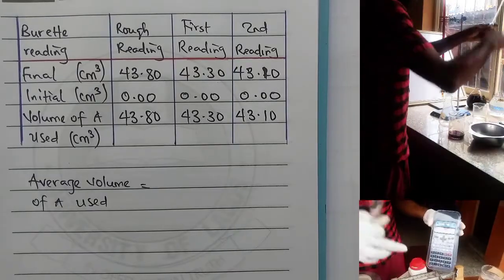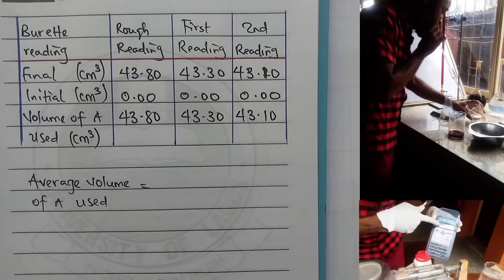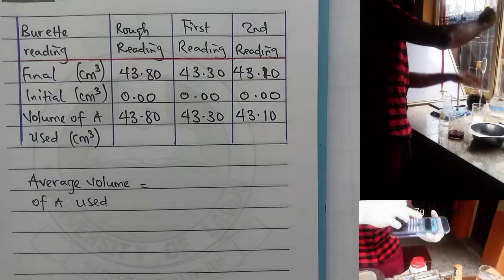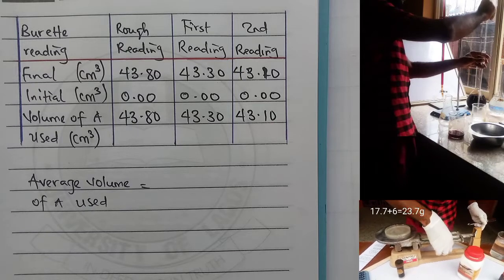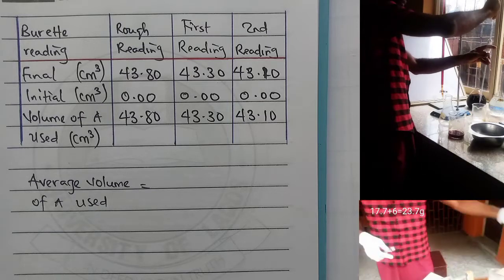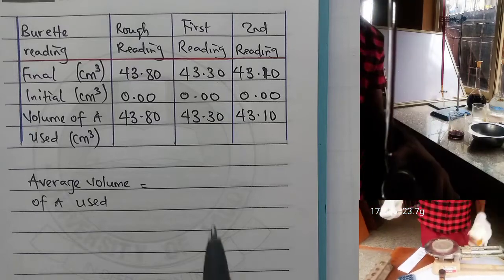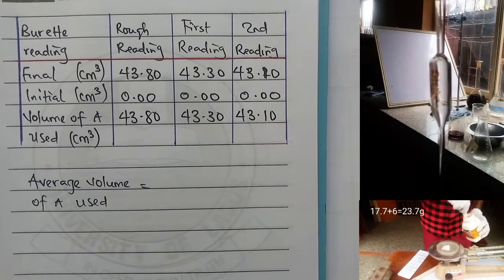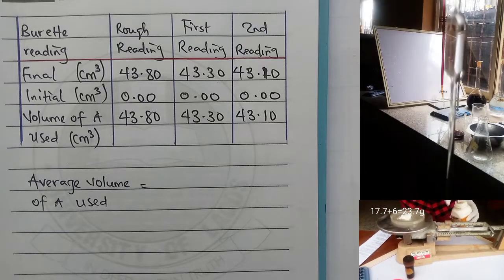Average volume of A used in this titration is supposed to be 3, but the volume of solution A used are much. Look at 43. If you do it up to 3 times, you will consume more than you are being given in school, and therefore I only did 3 times. The first one was the rough work, the second one was the first reading, and the third was actually the second reading. And I noticed there is a concordance value here, which is the difference between these, giving me 0.2. Therefore, let me just work with the first and second reading as you saw in the video.